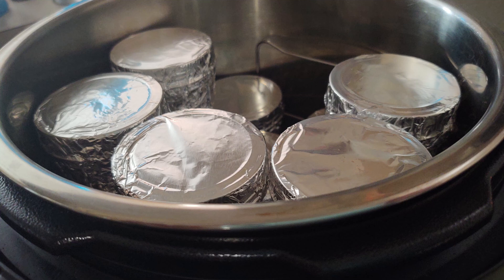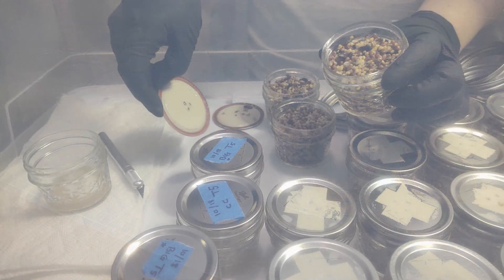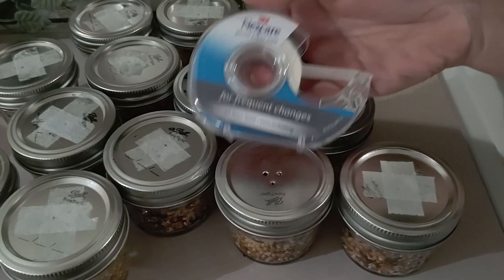Once your bird seed jars have cooled to room temperature, they're ready to use. We highly recommend using them as soon as possible for inoculation so they don't dry out. We've found that three holes in the top of the lid with micropore tape is perfect for inoculation.